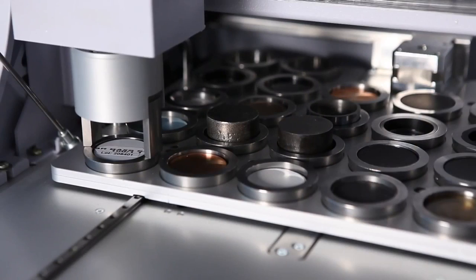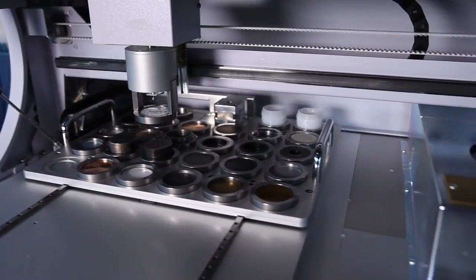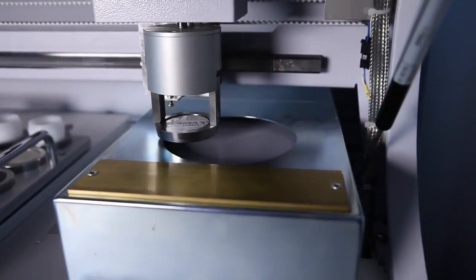We can also take spectra very quickly. An energy dispersive spectrometer takes the entire spectrum in one snapshot. You could measure a sample in as little as 20 seconds if all you wanted was a quick look at what you've actually got in the sample.